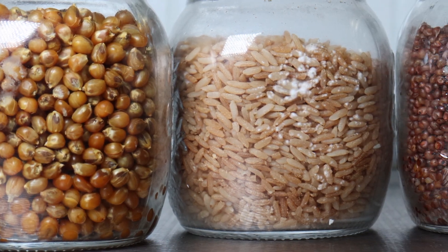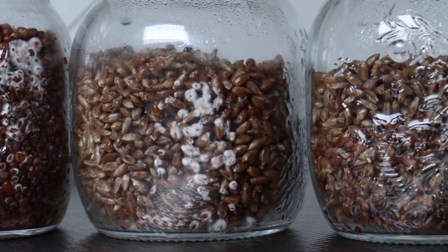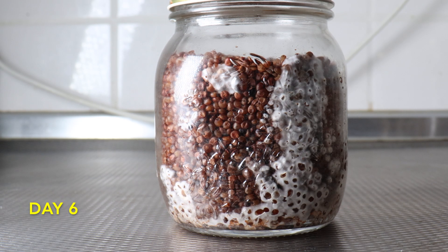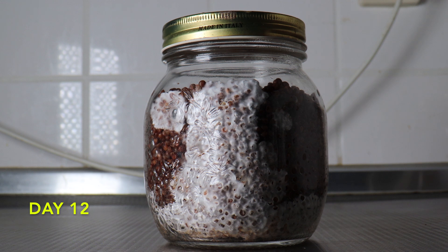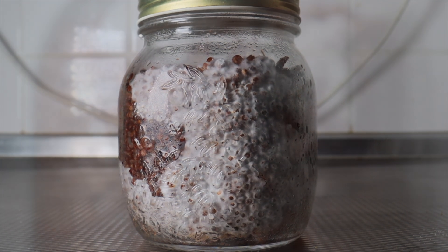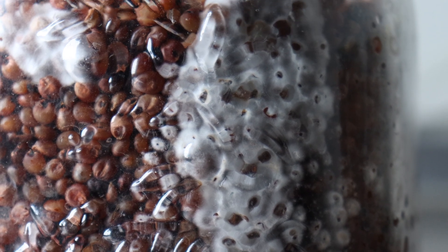And here we are, two days after inoculation and things are already starting to happen. Fantastic. So this is day two. Day six. Day nine. And here's day number 12. Progressing quite nicely. And 15 days. We can see it's colonising pretty fast. That mycelium seems to enjoy this sorghum. Some nice strong growth there.